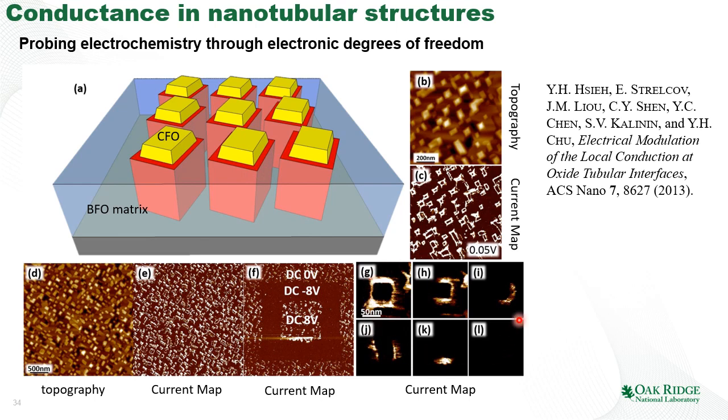And as shown in this data set, around one pillar we can have all four interfaces conductive, we can turn one off, and now only three are conductive, or in this case only two are conductive, or it is the other two. In this case only one is conductive, and in this case none is conductive.